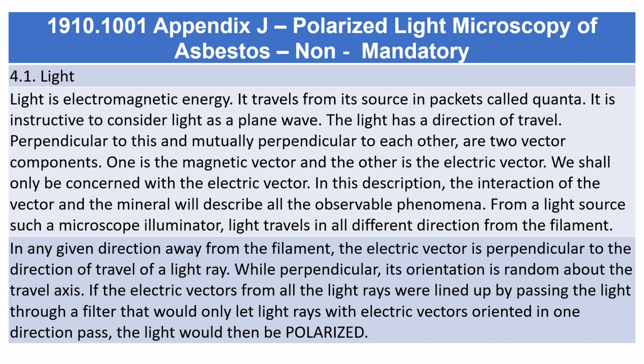One is the magnetic vector and the other is the electric vector. We shall only be concerned with the electric vector. In this description, the interaction of the vector and the mineral will describe all the observable phenomena.